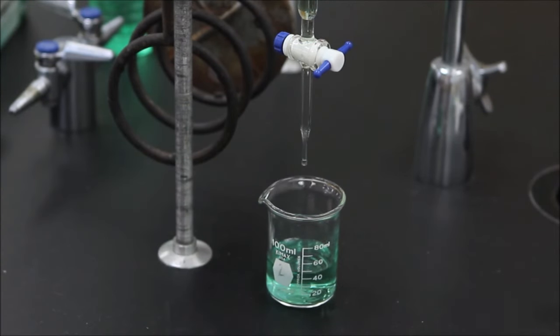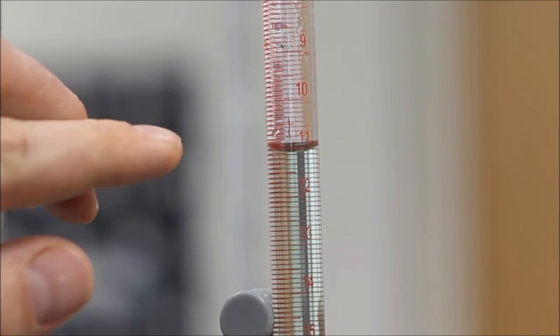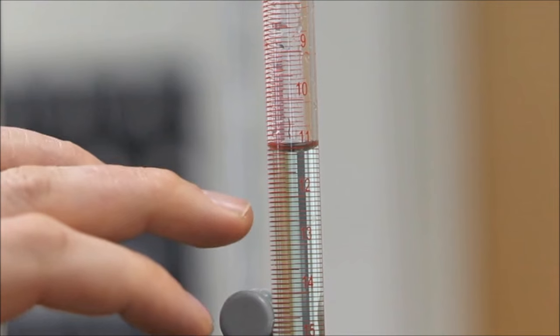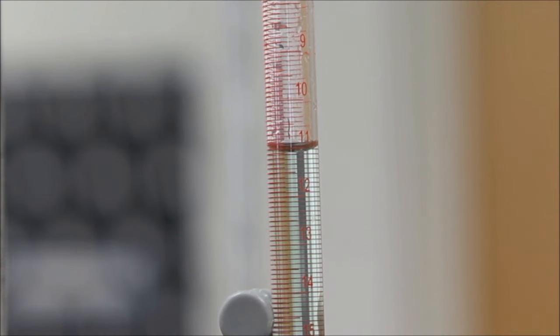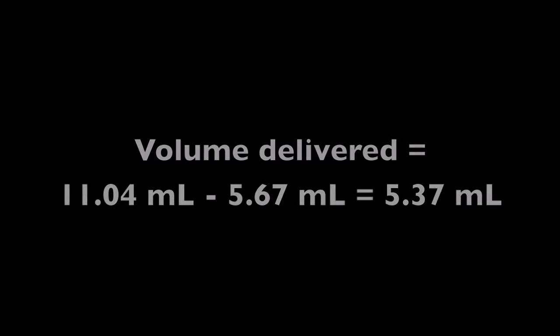After some of the liquid has drained out for the experiment, we are now ready to read the final volume of the burette. The meniscus is now between the 11 and 11.1 milliliter marks, and finally, estimating to the hundredths place, I record the final volume as 11.04 milliliters. The volume delivered in my experiment, then, is the difference between these two readings, 11.04 and 5.67, or 5.37 milliliters.